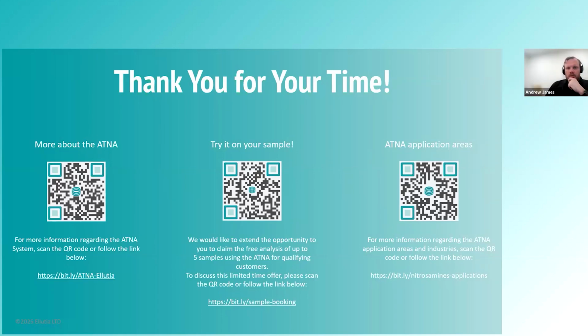Next question was, can this technique be used for nitrite determination in drinking water? What sort of sensitivity could be reached? Nitrites in drinking water, yes. We could detect down as low as 1 ppb of sodium nitrite. Now, I'm being careful with what I say here.